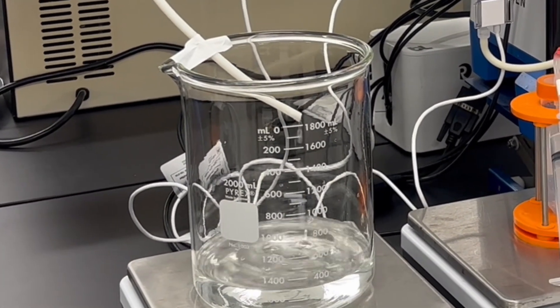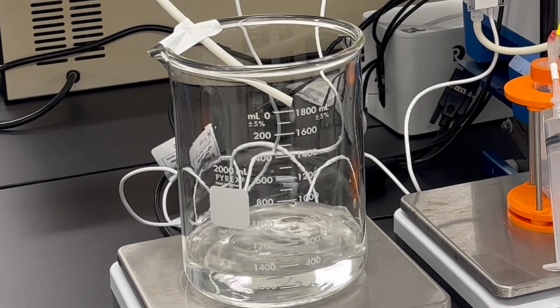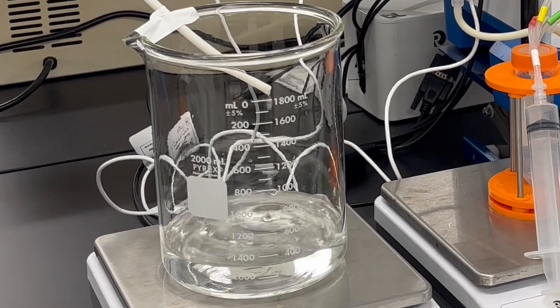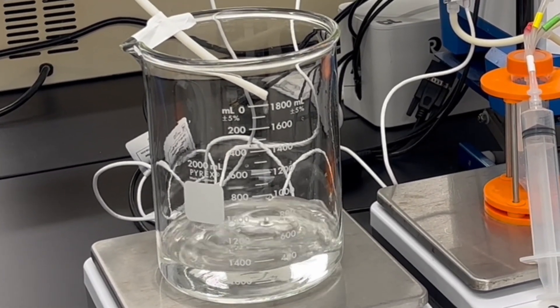On the other hand, increasing the product concentration can have the opposite effect in reduced permeate flux due to a phenomenon known as gel layer formation.